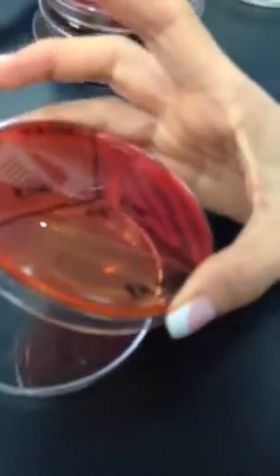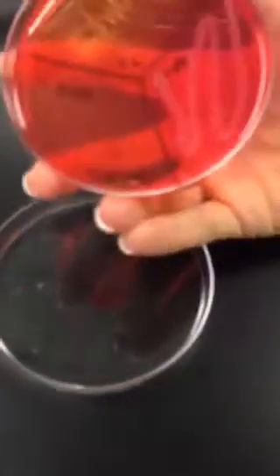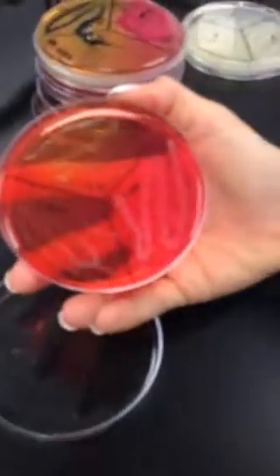The mannitol is a sugar. If the Staphylococcus can ferment mannitol, it will take up the mannitol, digest it, and excrete acid waste, and the acid waste will turn the agar yellow. Pathogenic bacteria, pathogenic Staphylococcus like Staph aureus, turn the agar yellow, they're pathogenic. If it doesn't turn the agar yellow, it just stays pink, and it grows, it's Staph epi, non-pathogenic.